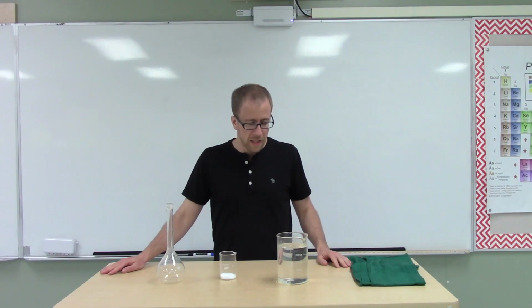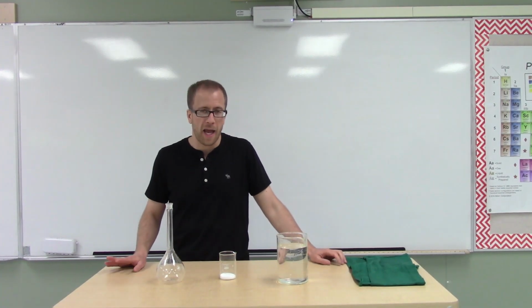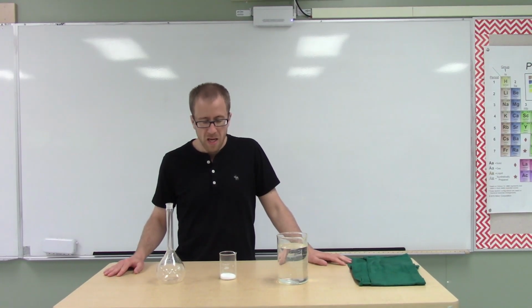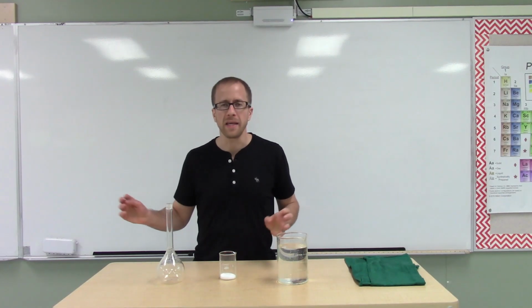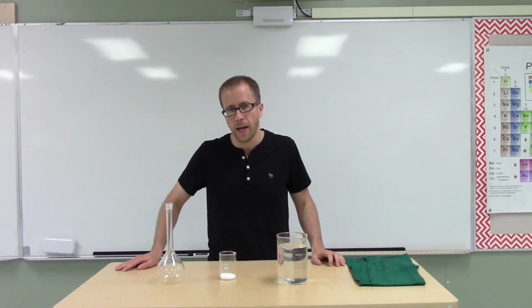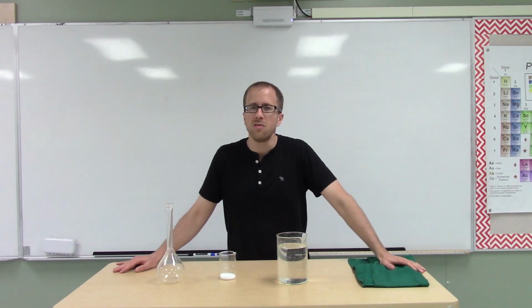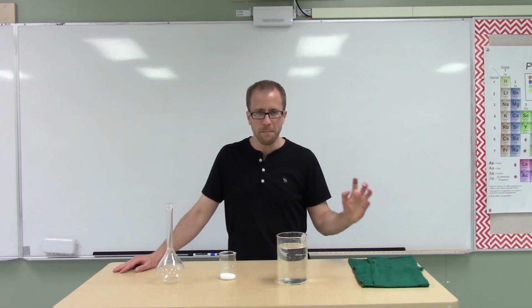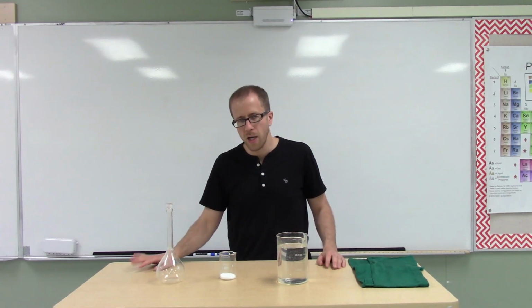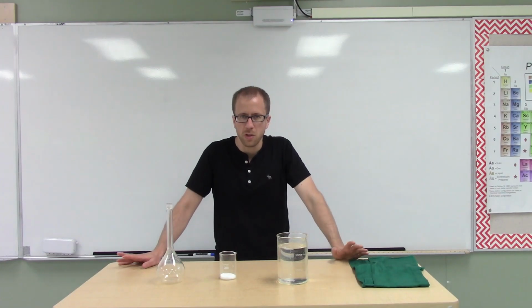Hello class. Today we are going to be exploring how to make a solution. In chemistry, it's an extremely important skill no matter what level you are at. So if I, for example, wanted to make, let's say, a 1 molar solution of sodium chloride, how would I do that? Well, what is molarity, right? 1 molar, what does that mean? Well, that means 1 mole per liter. So in chemistry, how would we then make that solution?